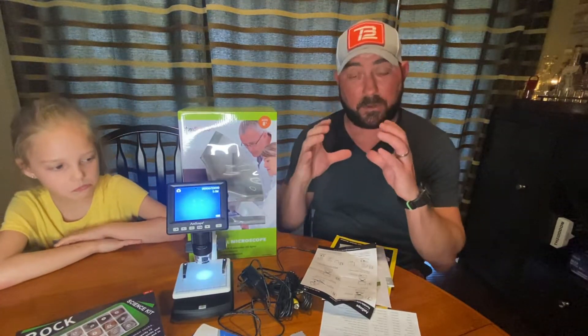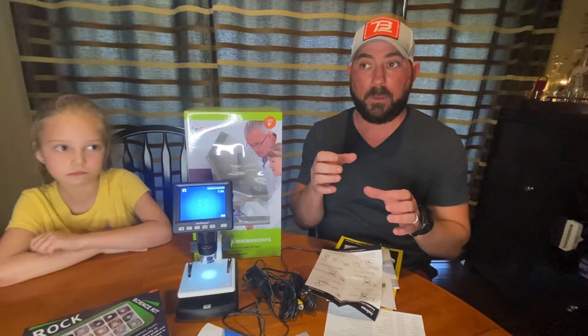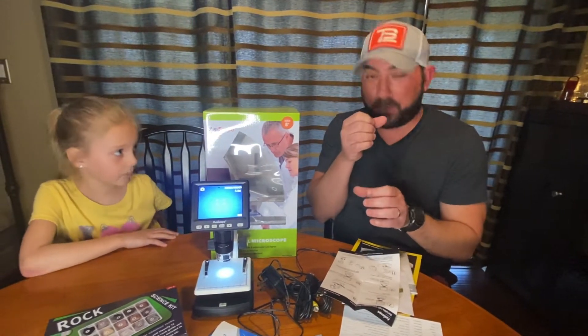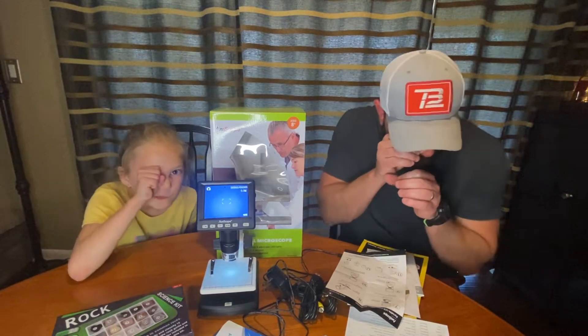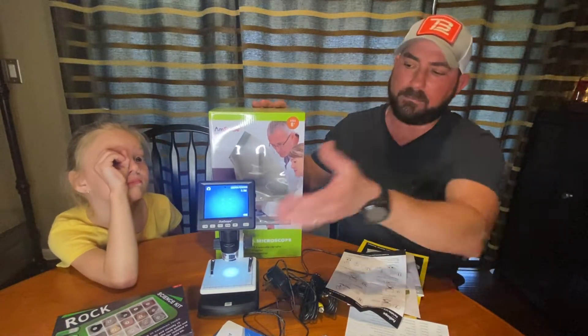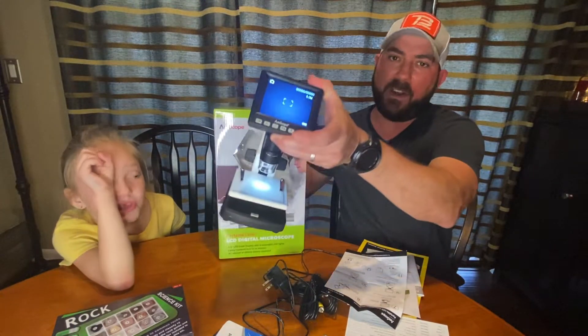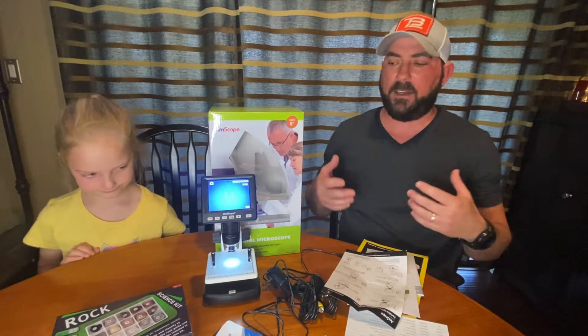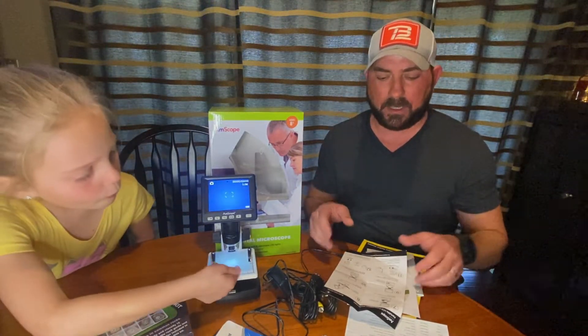It has a big digital screen so you don't have to — I guess when I was Fallon's age, when you grabbed the microscope you had to put your eye on it and you never could focus right. This thing, it's very simple, so we think it's going to show things very clearly and you don't have to put your eye up to it.